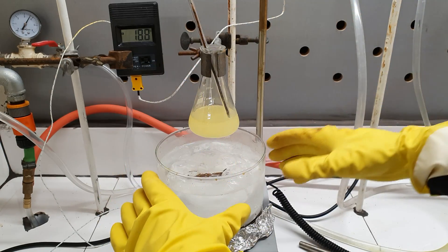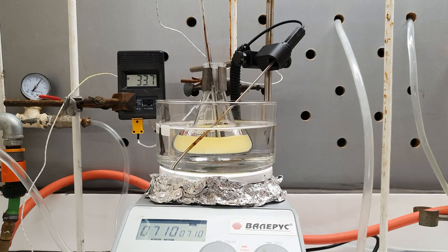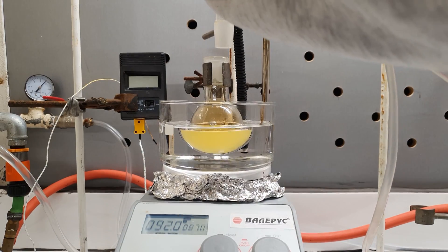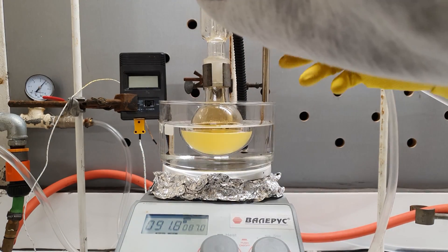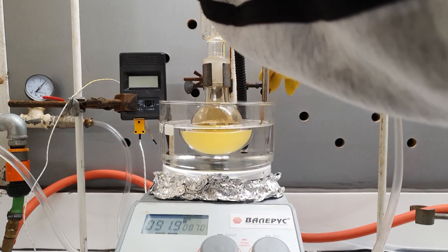Now I have to heat the mixture on an oil bath to 90 degrees Celsius for 2 hours. At first, I tried to do it in my Erlenmeyer flask. However, I soon realized where this was going — the reaction would produce tons of toxic fumes filling my lab. So I transferred everything into a ground glass joint 100 ml round bottom flask, on top of which I could equip a condenser.